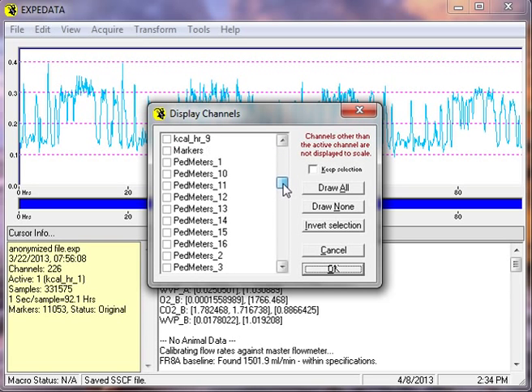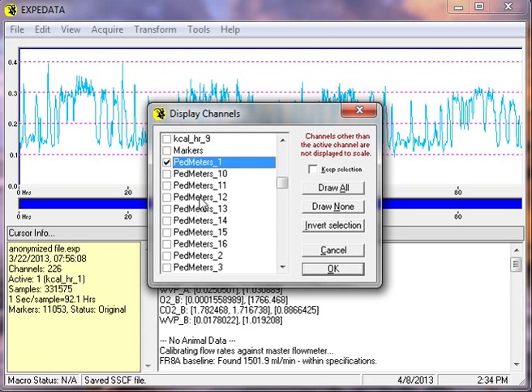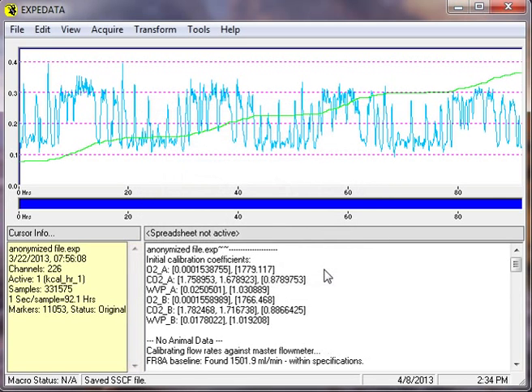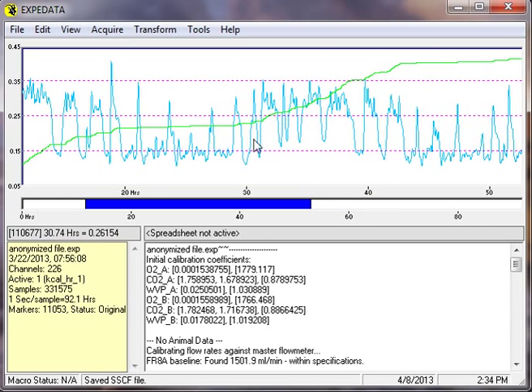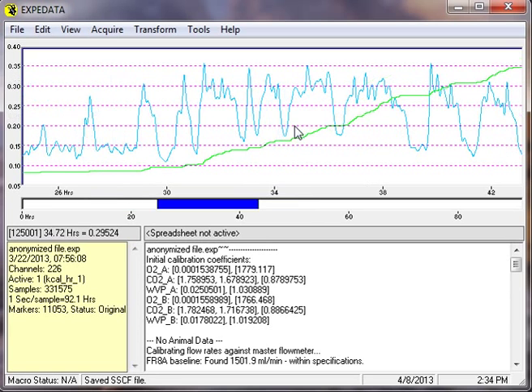we're simply going to go ahead and display the cumulative distance. So we scroll down, pedestrian meters, click the box, click OK.